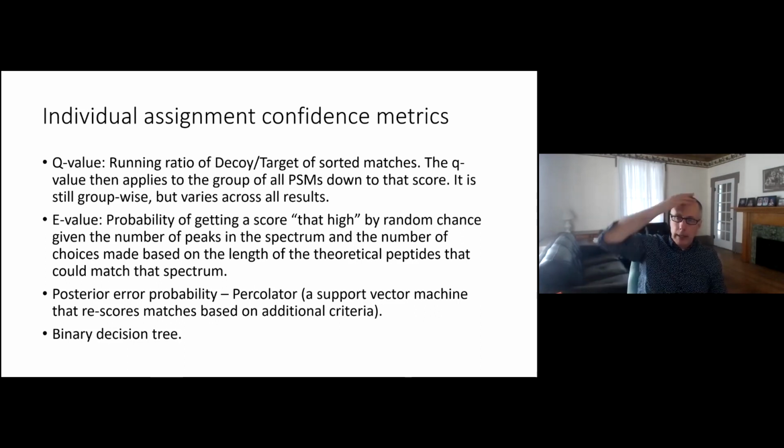I mean, you're biased the wrong way. You're giving too much to the target match, and too little to the quote unquote decoy.